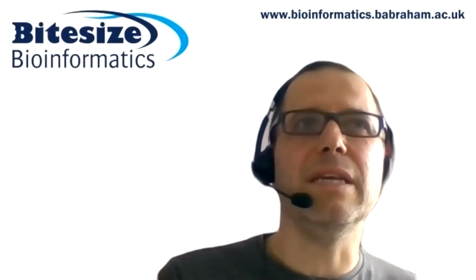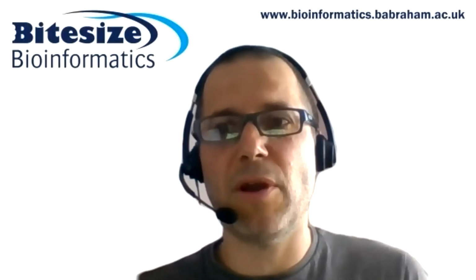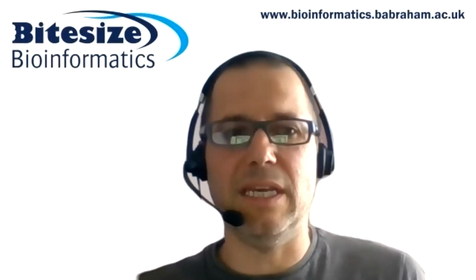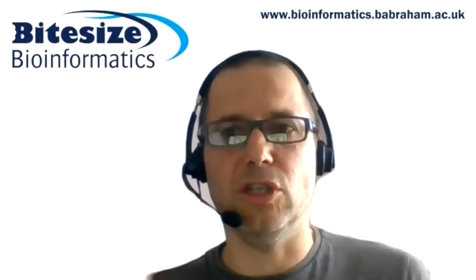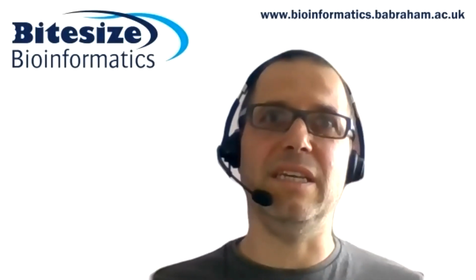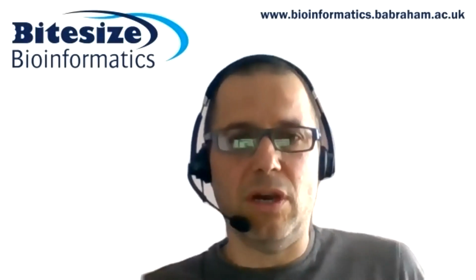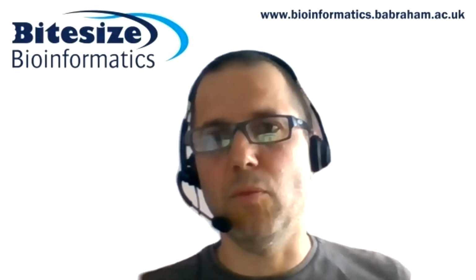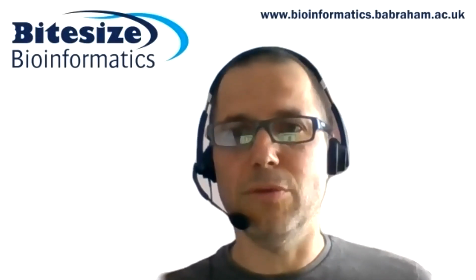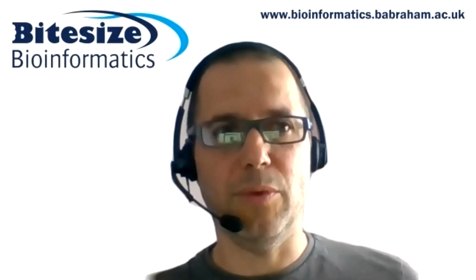So mostly this is data that comes from high throughput sequencing experiments. Anything where the point of doing the sequencing is to identify positions on a genome. So ChIP-Seq, ATAC-Seq, RNA-Seq, bisulfite sequencing, Hi-C, any of those kind of techniques are amenable to work within here. But any other data type that generates a large set of genomic positions that you want to be able to visualize and analyze would also work with this as well.